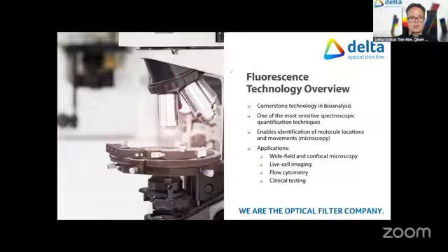So, of course, you know that fluorescence technology is one of the cornerstone technologies in bioanalysis. It's because it's one of the most sensitive spectroscopic techniques that can be used. And in point measurements it enables the identification of molecules. And if you use it in microscopy, you can also see the movement. And if we do time resolved, also the temporal development of biological phenomena. It's used in wide field technology, microscopy and confocal. We have seen examples of that before. It's used in live cell imaging, flow cytometry, and also in clinical testing.